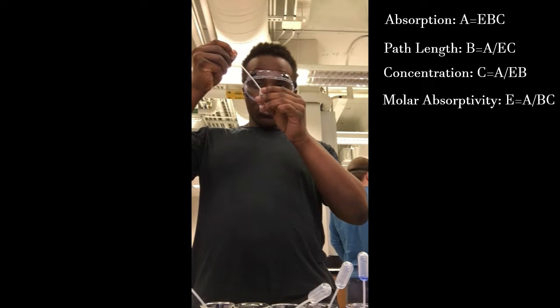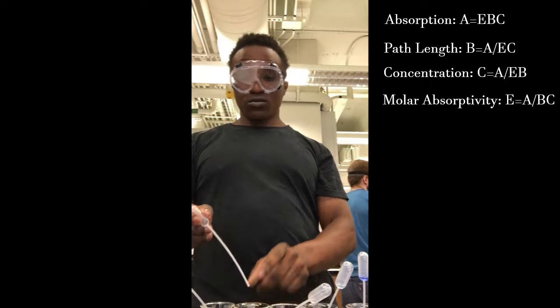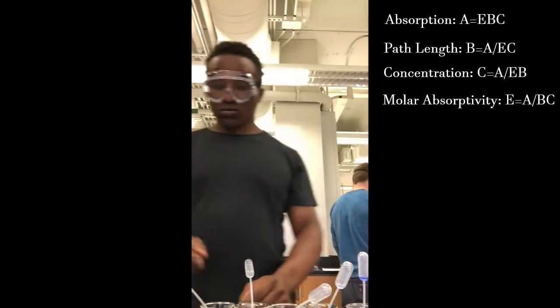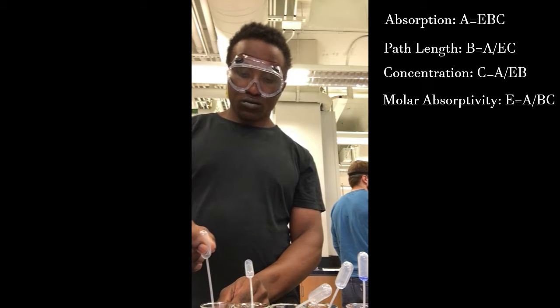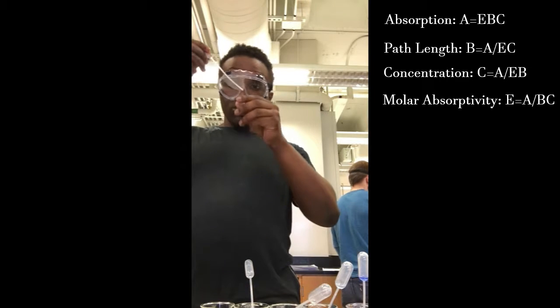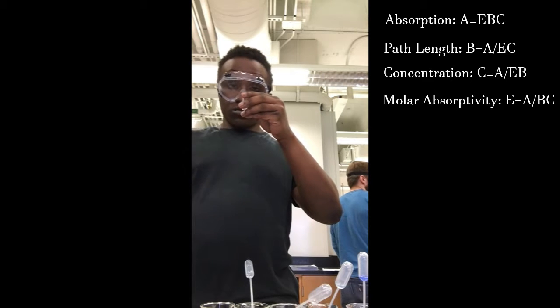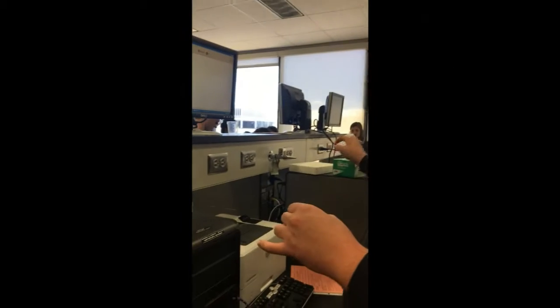This is also a good time to review the Beer-Lambert law. It is the law that allows us to find the unknown solution concentration, the concentration of the chemical. It states the positive correlation between absorbance and concentration. Here you can read all of the variables involved with the Beer-Lambert law, from absorption to molar absorptivity.